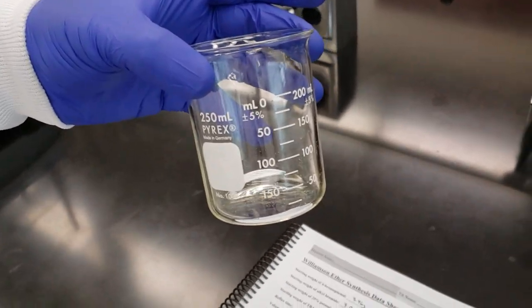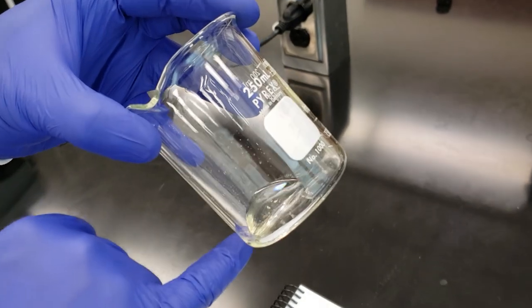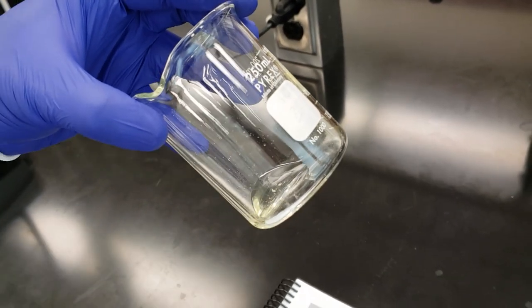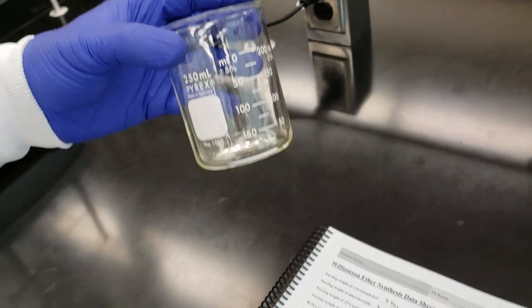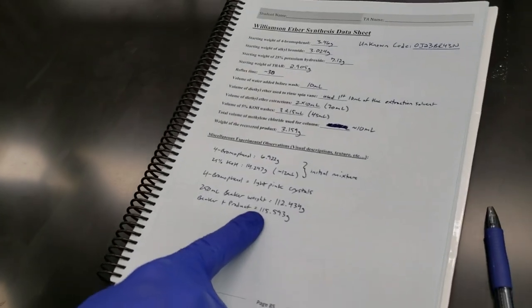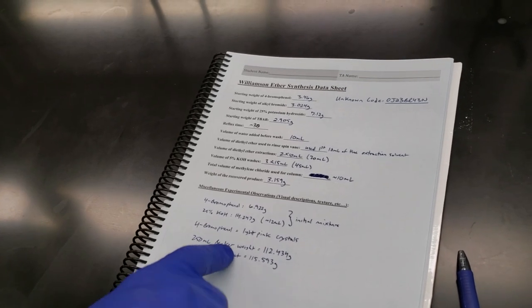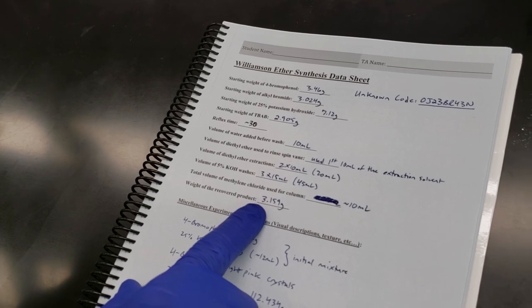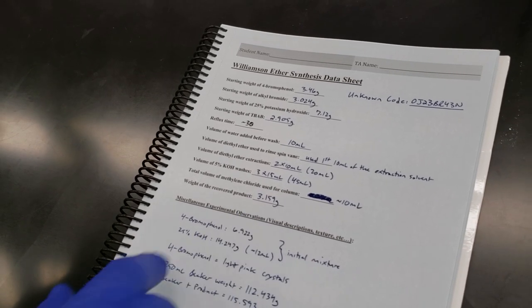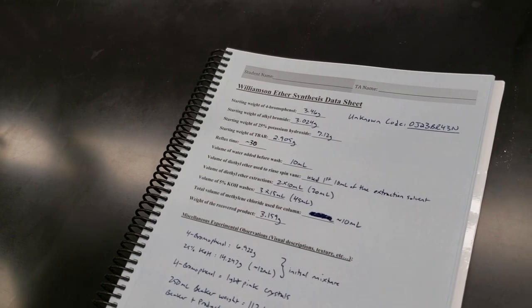And then our recovered product: we've finished removing our diethyl ether and our methylene chloride from our product. What we're left with is a slightly yellow, transparent, viscous liquid. Okay, we weighed this with our beaker. It came out to be 115.593 grams. We subtracted out the weight of our tared beaker, and that left us with a recovered product weight of 3.159 grams. So that's the amount that we're going to use to do our percent yield calculations for this experiment.